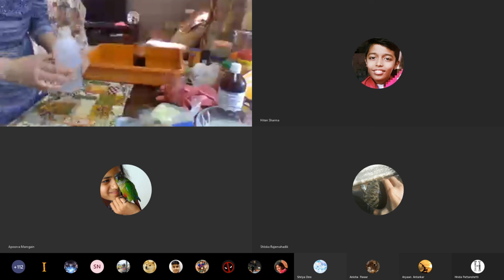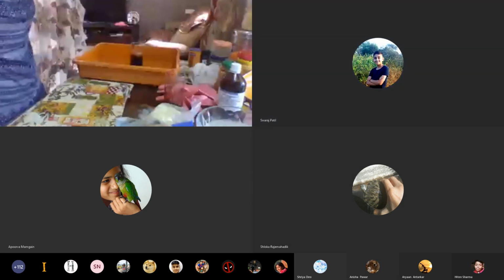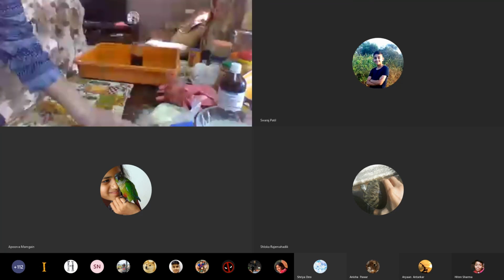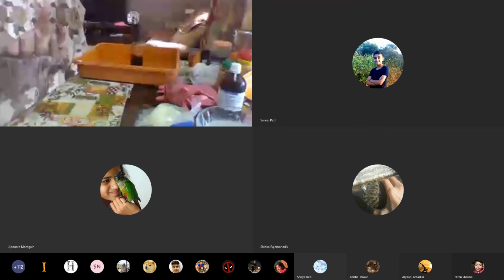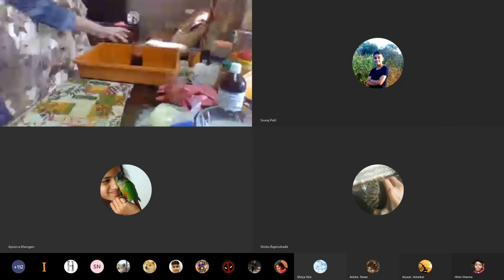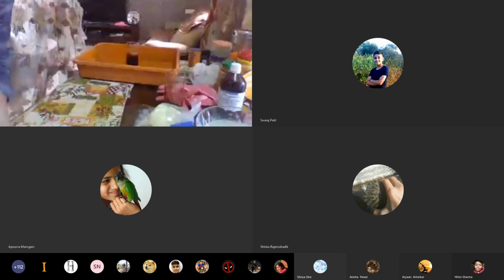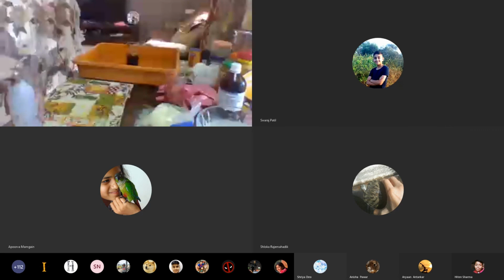Ma'am, why is it called elephant toothpaste? Because it comes out like toothpaste. Normally the toothpaste which comes out is very small, but the paste when it forms here is huge. That's the reason. So now be tuned and please look towards the reaction. I'm going to move away because it releases heat. I'm going to add hydrogen peroxide.